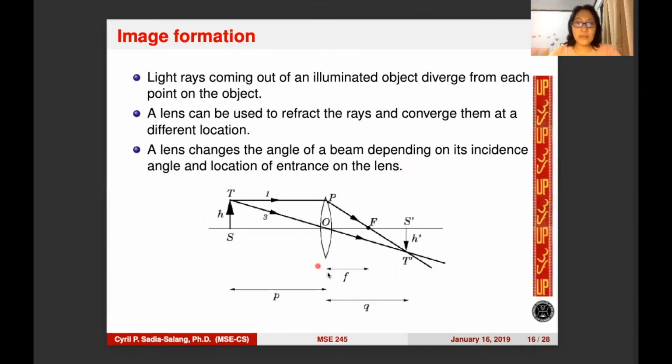We have to understand image formation. We're going to use an optical microscope. The convex lens shown has been shaped so that all light rays that enter it parallel to its axis, this one is the axis, cross one another at a single point on the opposite side of the lens. Again, the axis is defined to be a line normal to the lens at its center.